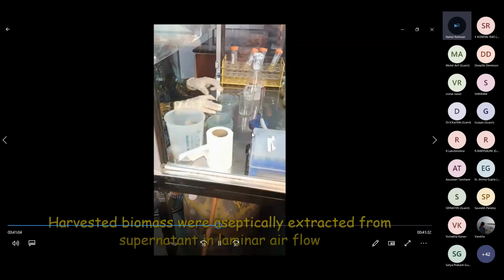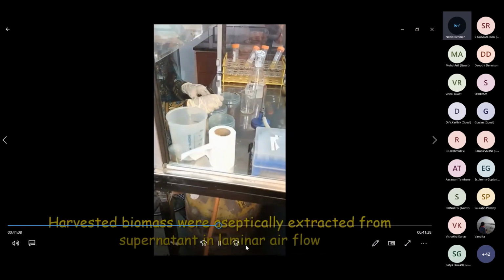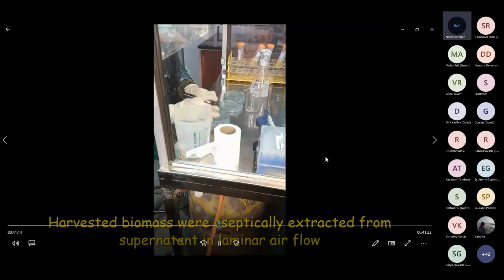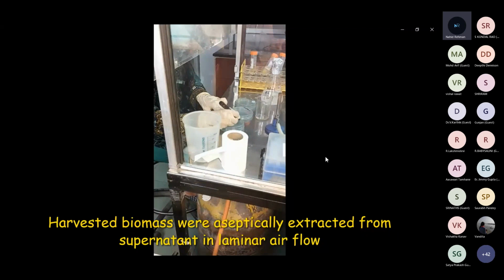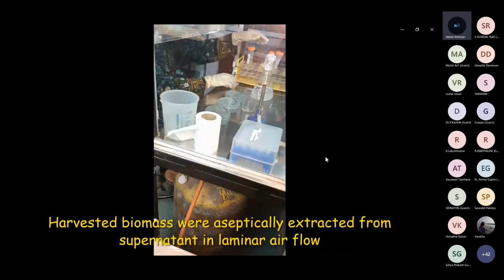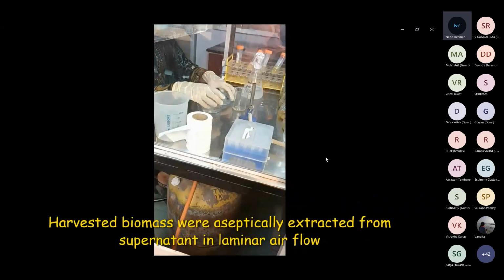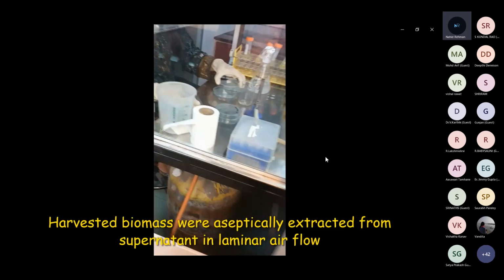Okay, then what is she doing? She is trying to... all these harvested biomass will be aseptically extracted. But it was not needed to do it aseptically, let me tell you, because after all you have to extract out, and the residues will be used for extraction of hydrogen. Let us see what she is showing.